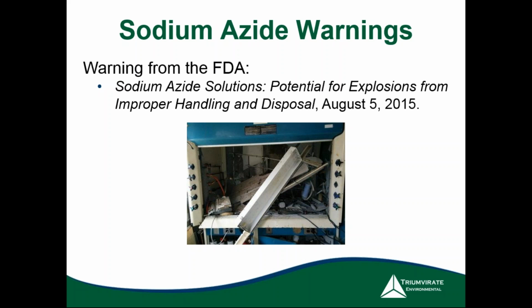The experiment that he was performing involved the use of sodium azide and polyethylene glycol, and he was trying to make trimethylsilyl azide. And this unfortunately happened when there was personnel in the lab. They think that he just heated up the sodium azide too quickly, and obviously if it's used in airbags, you're going to get a good explosion if you heat it up. And overheating caused injuries such as second-degree burns, cuts requiring stitches, debris in the eyes, glass injuries, eardrum injuries, and psychological trauma. So with that, we'll go into recommendations for proper handling, storage, and disposal.